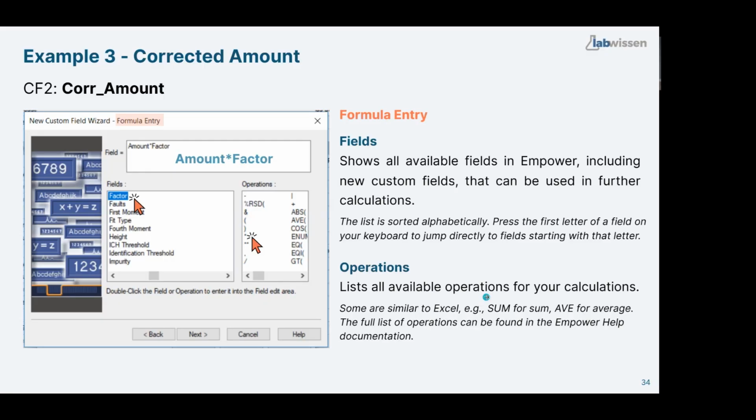Yes, that was it for formula entry. Always double check it. If you typed it wrong, Empower will complain. So it won't let you type amount without T. It will really complain. So it's not like you can do a lot wrong here, but you know, troubleshooting here when you see it and you have a big formula and you're thinking, where's my mistake? Yes, why is it complaining? Yeah, always double check it.